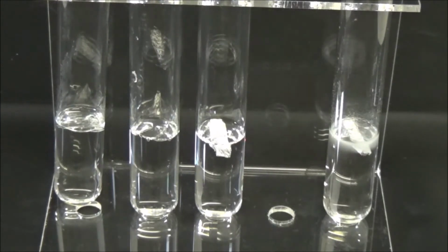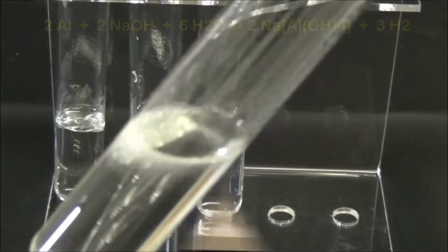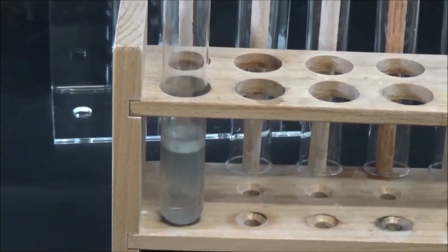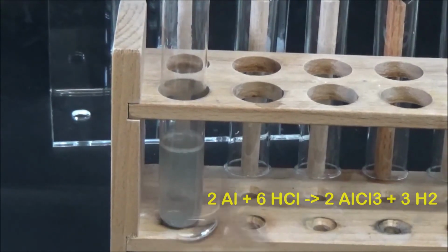Aluminum is amphoteric, which means that in the presence of bases it does not form a cation, but becomes part of the anion. Sodium aluminate and hydrogen form in this way with sodium hydroxide. Hydrochloric acid only attacks aluminum when heated or in higher concentrations. Aluminum chloride and hydrogen are formed here.